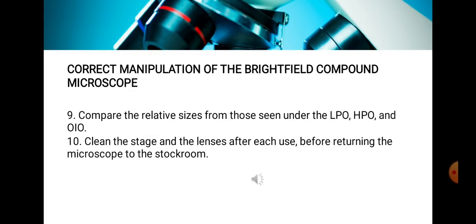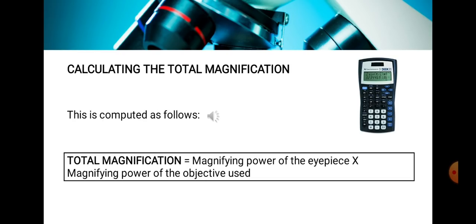Now that you have done viewing under LPO, HPO, and OIO, you may compare the relative sizes from those objectives. And then after using the microscope, clean the stage and the lenses after each use before returning the microscope to the stockroom.